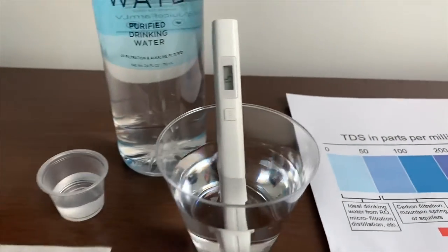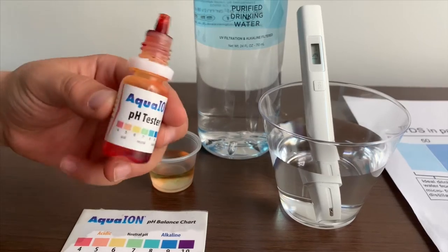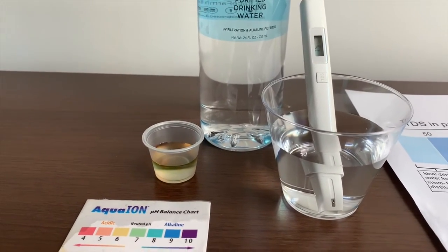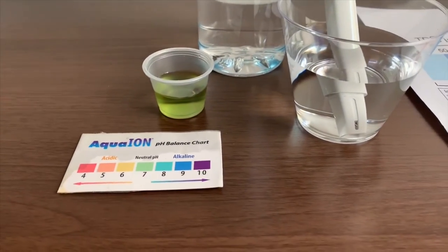Now let's test the pH levels. Only do two drops. If you want to buy this pH tester, check the link down below. Let's stir a little for a better result. I give this a seven — this is neutral pH.